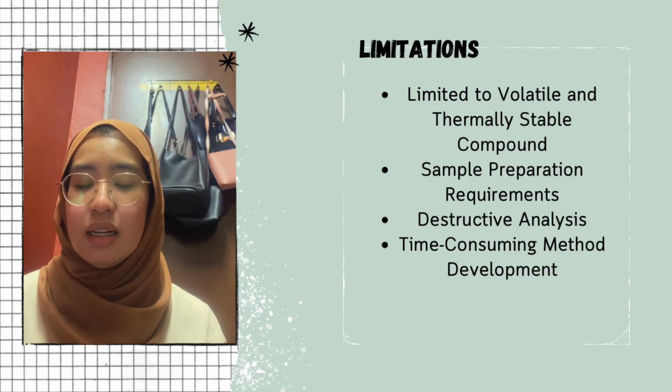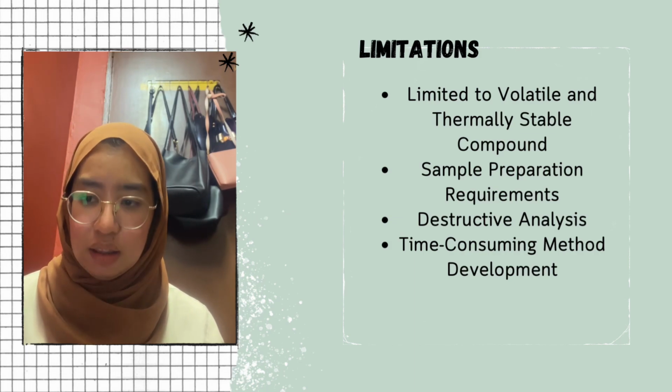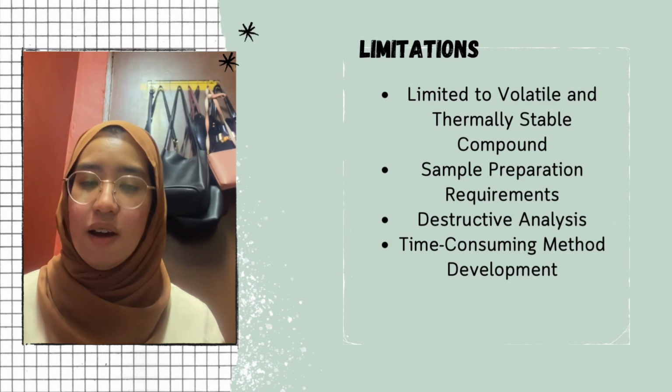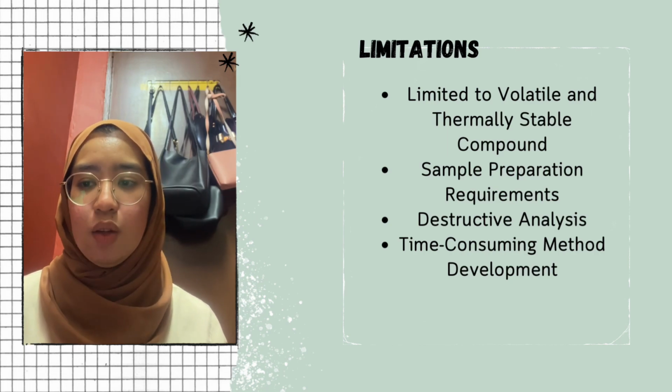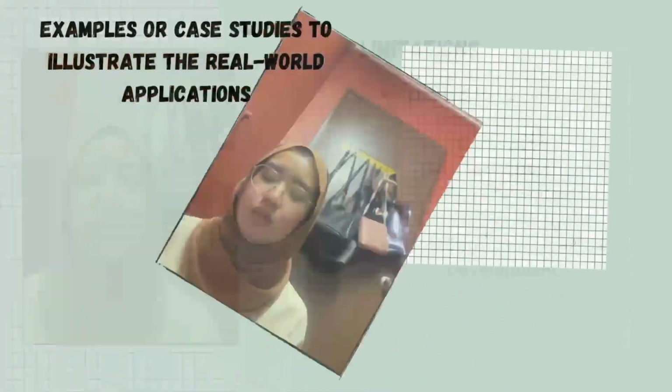Next, it can be destructive analysis. Some detectors, such as flame ionization detectors, are destructive, meaning the sample cannot be recovered after analysis. The last one, time-consuming method development. Developing a GC method with optimal conditions for separation and detection can require significant trial and error.